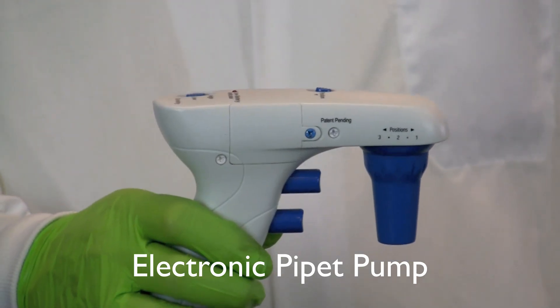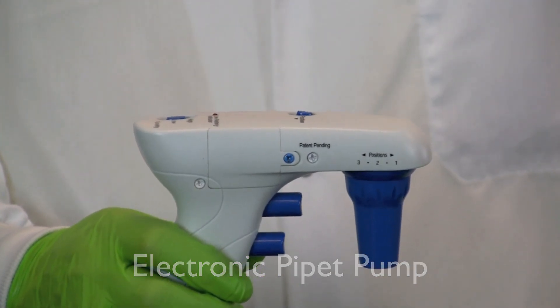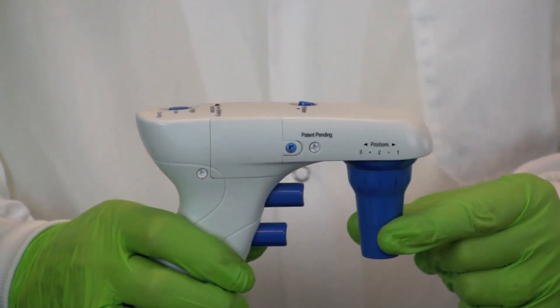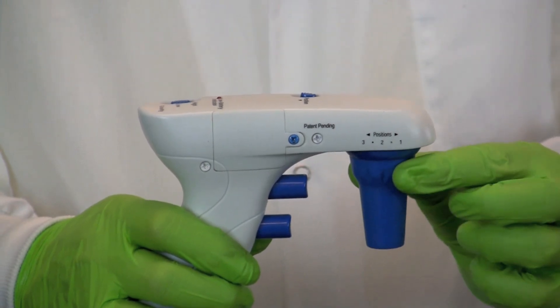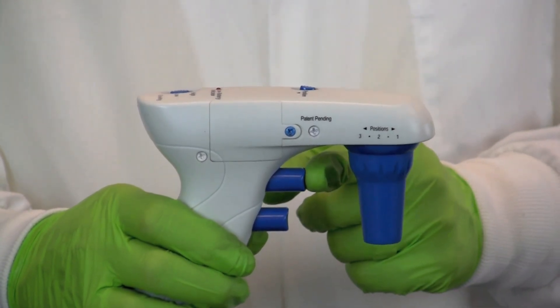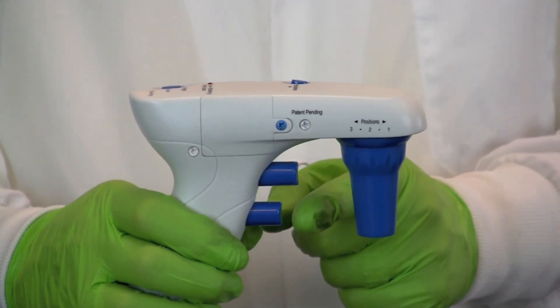The parts of an electronic pipette pump include the gasket that connects to the pipette, a filter that prevents any contaminants from getting into the pump, a suction button, and an exhaust button.